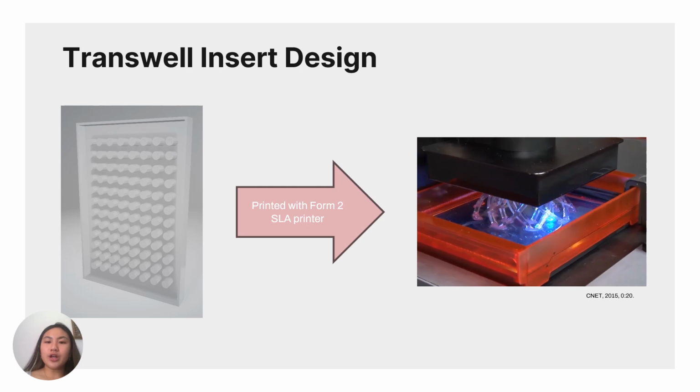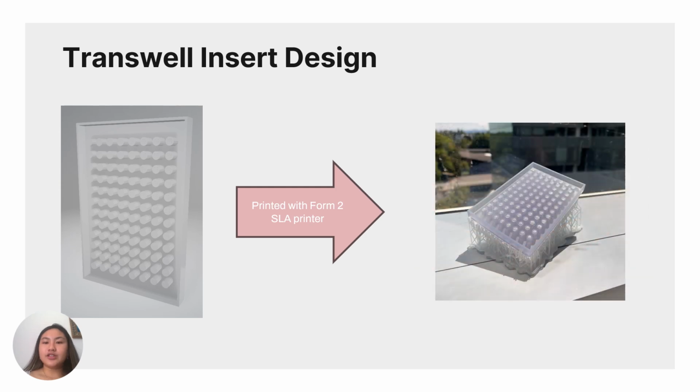Now, an SLA printer utilizes a resin reservoir, and so a platform is dunked into the resin reservoir, and a laser cures the resin layer by layer, and so the platform lifts up, allows excess resin to drip, and then is dunked back in again, just like this short video clip showing an SLA printer in action. And so we decided to utilize the Dental LT Clear V2 resin specifically for its biocompatibility and its autoclavability. So we are going to be able to reuse this resin per its specifications, and it is also biocompatible, meaning that we are able to use it with cells and it's not biotoxic.